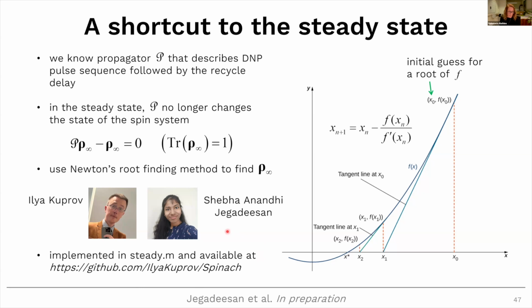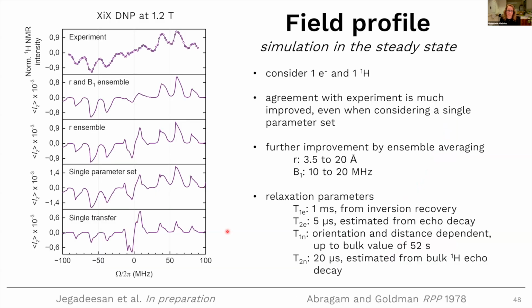So meanwhile, we realized how nicely this was working. My postdoc, Shiba, has been using this to do better simulations of post-DNP. And as you see, the results are really very nice.